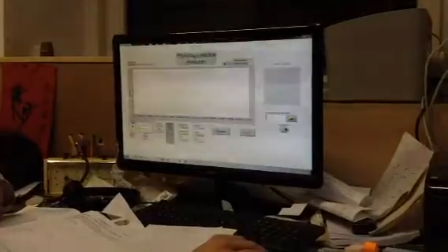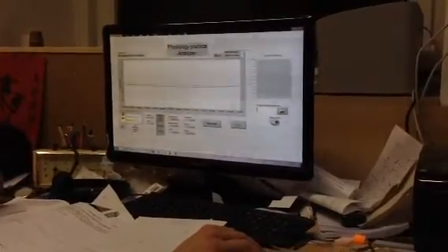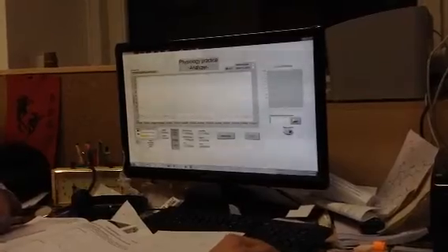And then you have to open the analyzer from here, and it will be on the desktop. Input data, and input your previously saved file. What do you do if you cannot see the whole experiment? Zoom out. And how? The middle one and the left one, exactly. Then you will see the markers and your contractions as well.